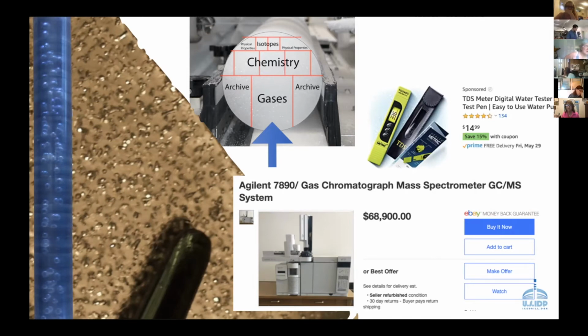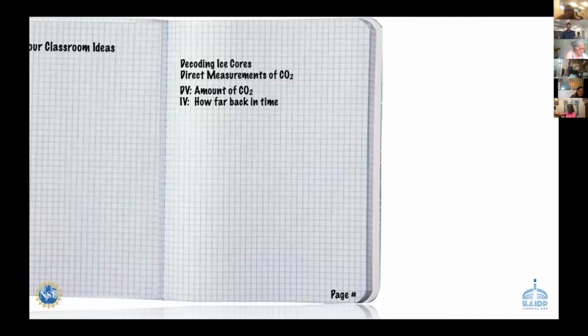Bill, yes, this distilled water measures 1 microsiemens per centimeter. I can't quite hear you, Rose. I just measured my distilled water to make sure it is 0, but it is 1. My distilled water gives the reading of 1. Yep, your distilled water might have a little bit of conductivity. Sometimes that happens. And that's why I said in that video, it's really important everybody has their own conductivity meter, and travel around the room with your conductivity meter, because every conductivity meter is calibrated a little bit differently. Let me keep going so we can collect a little bit of data.